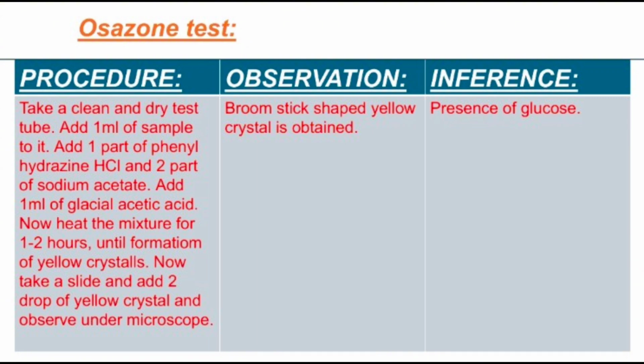acid. Now heat the mixture for 1 to 2 hours until formation of yellow crystals. Now take a slide, add 2 drops of the yellow crystals and observe under the microscope.